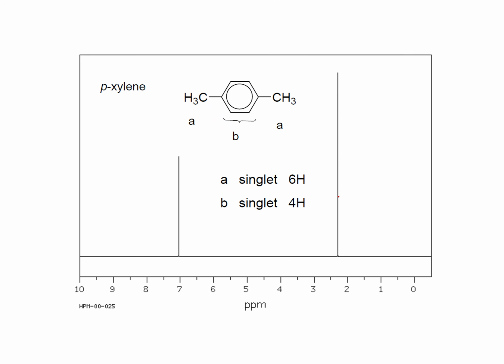Now look at paraxylene. So it's related to benzene. Whenever benzene's NMR spectrum is needed, its position would be around 7. Okay, now I think we can easily understand why it is 7. For B it is singlet, its position is 7, and its height would be 4.